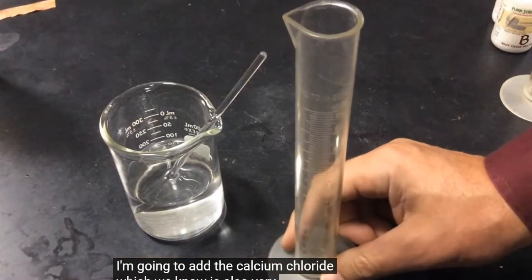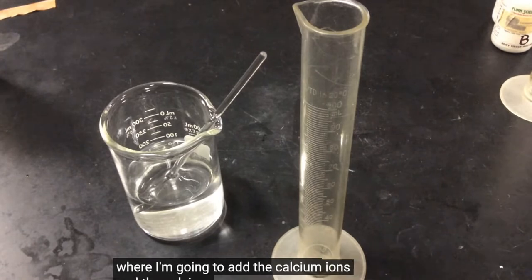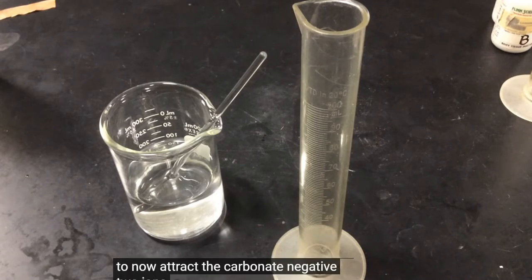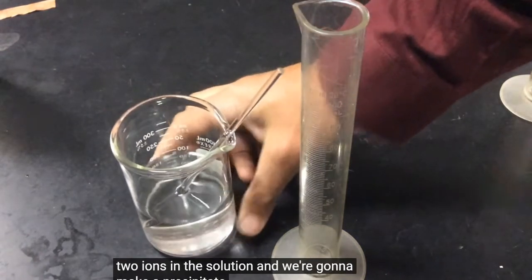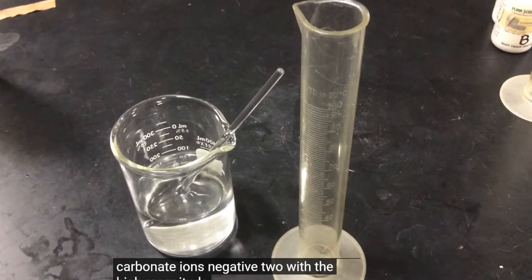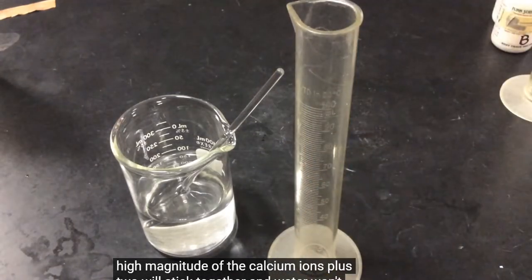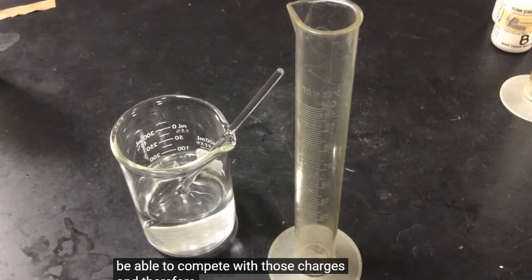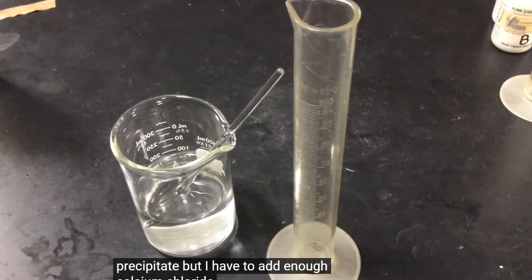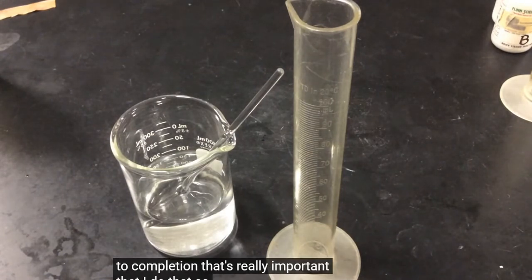This solution of calcium chloride is where I'm going to add the calcium ions, and the calcium plus two ions are going to attract the carbonate negative two ions in the solution. So we're going to make precipitate because, knowing Coulomb's law, the high magnitude of the carbonate ions, negative 2, with the high magnitude of the calcium ions, plus 2, will stick together, and water will not be able to compete with those charges, and therefore they'll make a crystal and a precipitate. But I have to add enough calcium chloride to drive the reaction to completion. That's really important. So I have to have more than enough calcium chloride.